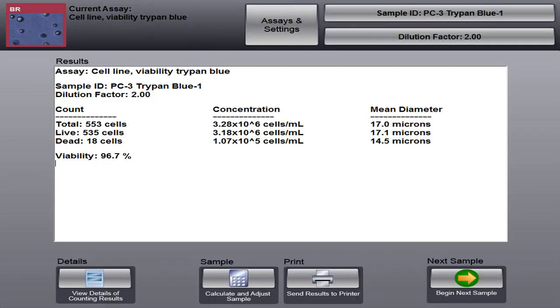And you'll see that this looks a little bit different compared to the total cell concentration assay. We have total live and dead cell count, concentration, and average diameter. And our viability is reported at about 97%. So let's go back. We can look at our details.